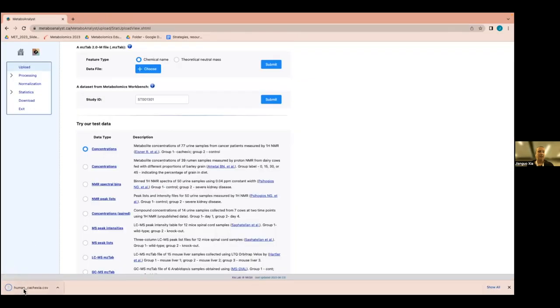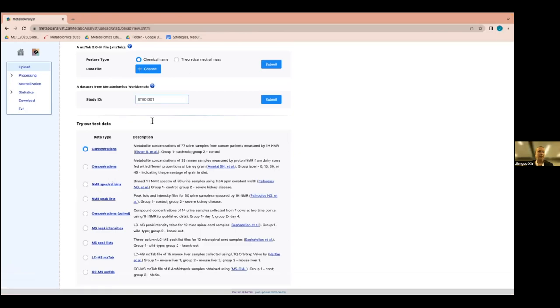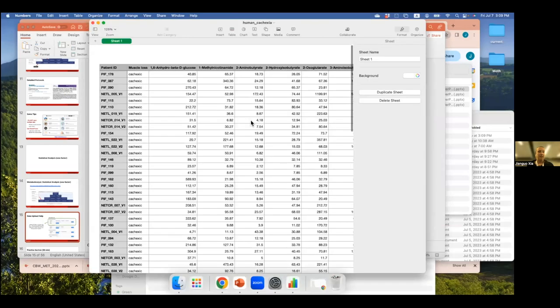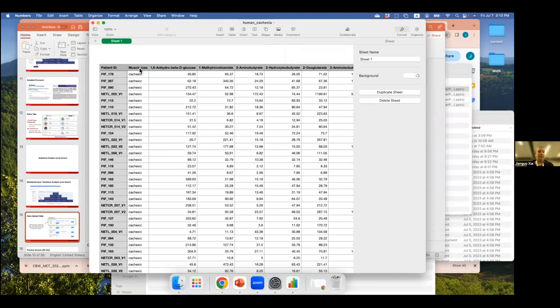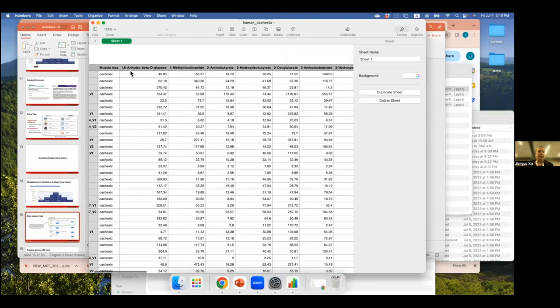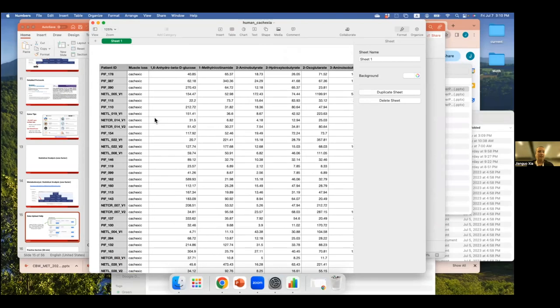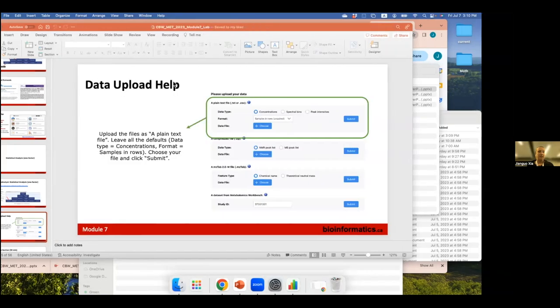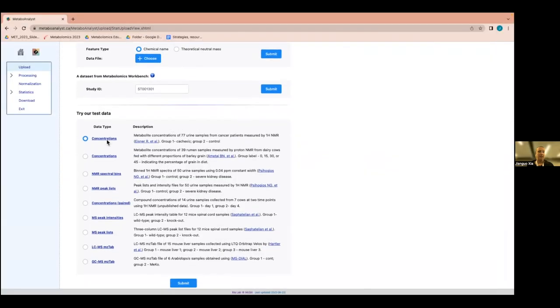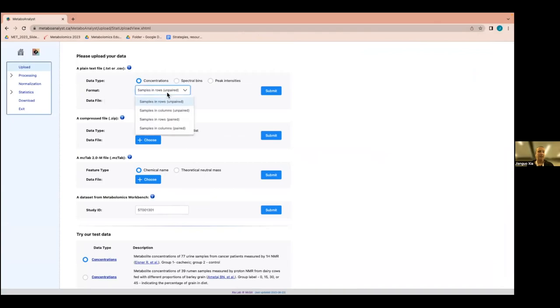I'm going to open up the example data to show what it looks like. We always have our sample name in the first column, then our single one-factor categorical metadata in the second column, and then all the concentrations of each metabolite. Each column is a metabolite and all values are in the cells. It can also be arranged the other way — samples in columns and metabolites in rows — you just have to tell MetaboAnalyst what you're uploading.